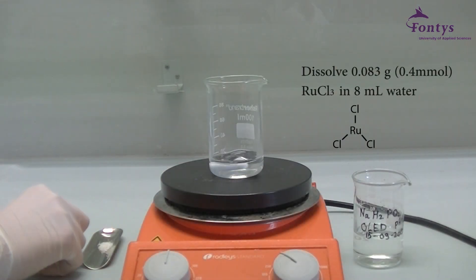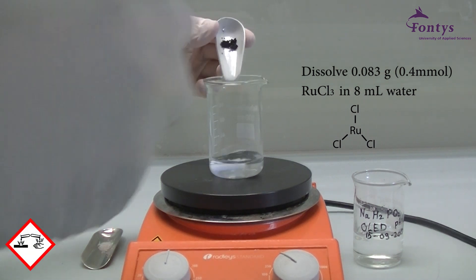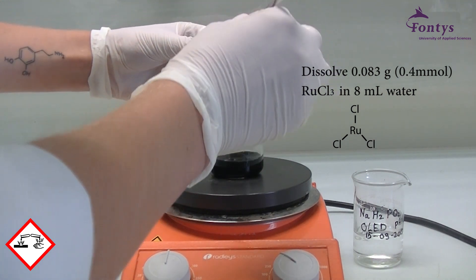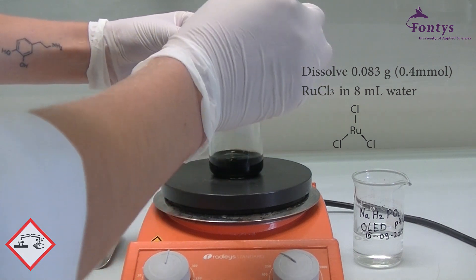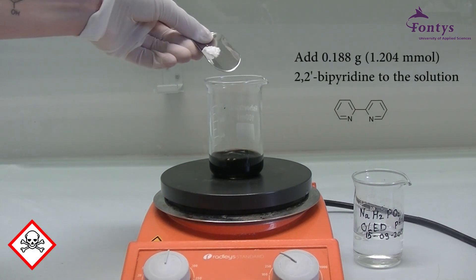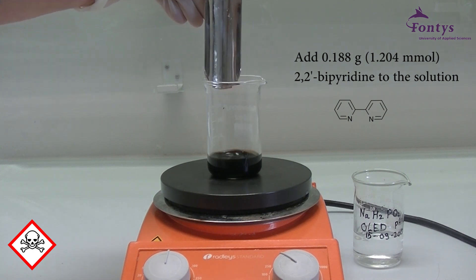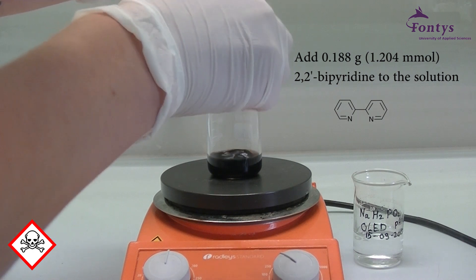First we are going to dissolve 0.083 grams of ruthenium trichloride in 8 ml of water. Do not forget that this chemical is corrosive. Secondly, 0.188 grams of 2,2-bipyridine will be added to the solution. 2,2-bipyridine is highly toxic, so be careful.